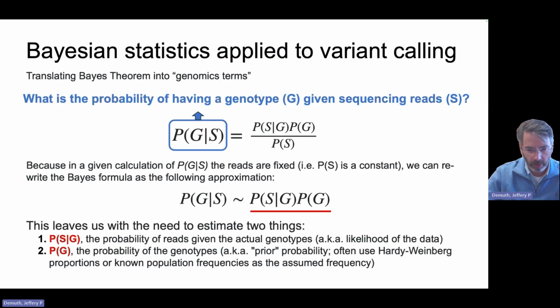So this example is Freebayes, but again, lots of variant calling software has gotten sort of sophisticated in the kinds of uncertainty it can incorporate into the variant calling. So Freebayes, the name sort of implies the rationale here. We're taking Bayesian statistics and applying it to variant calling. If you're not familiar with Bayesian statistics, that's okay. You don't have to understand the math behind this or the statistics behind this to really appreciate on a conceptual level what's going to be happening here.